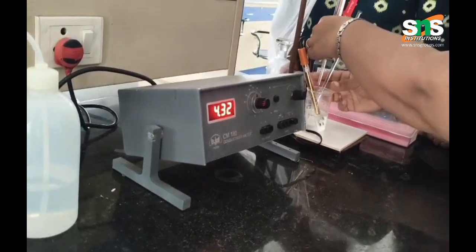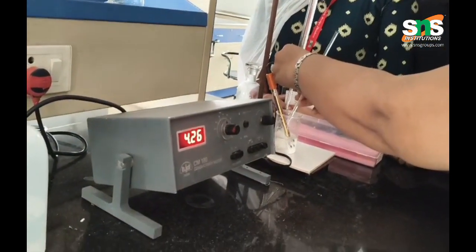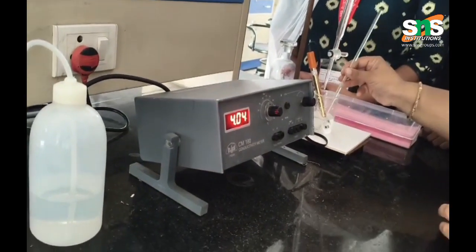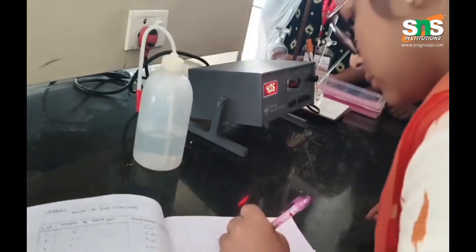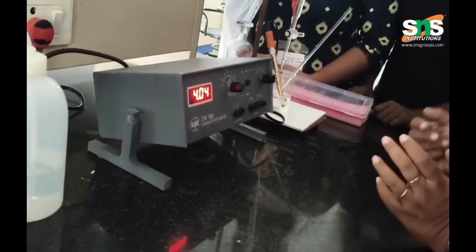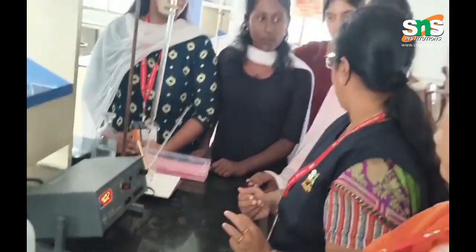Now I am adding sodium hydroxide again and stirring the solution. The conductance value is again decreasing. Note the value. So you are getting a decreasing value, and you have to take the readings.